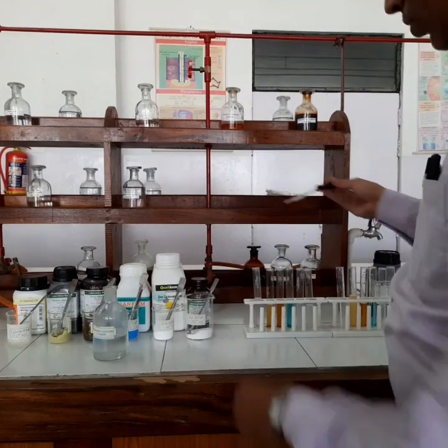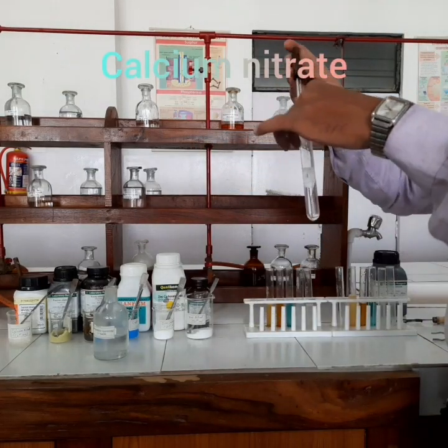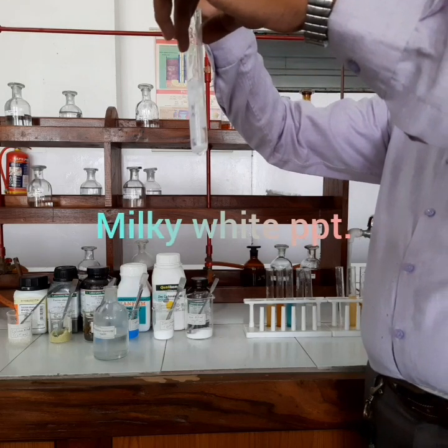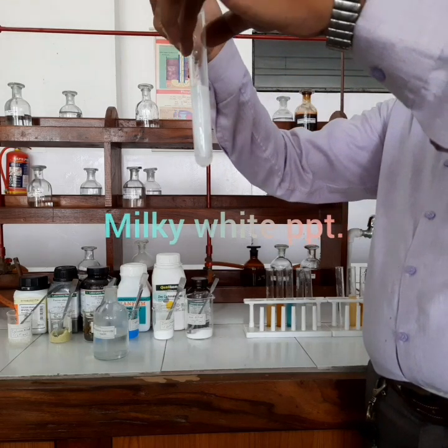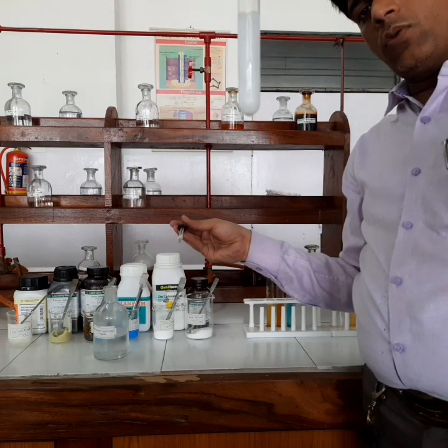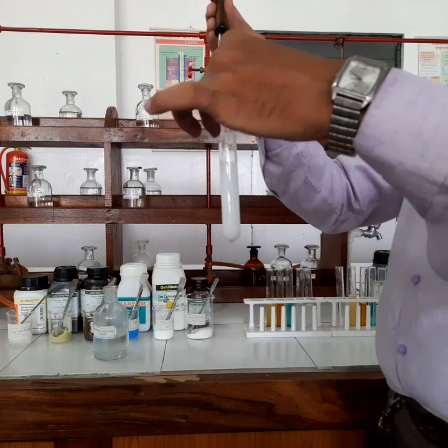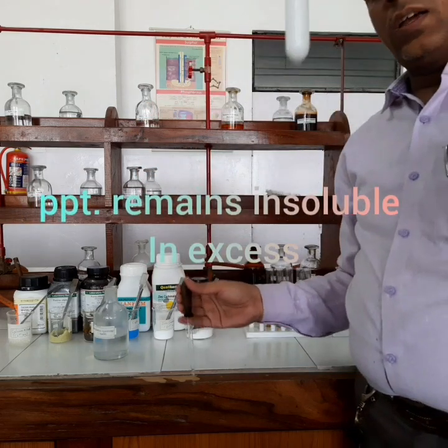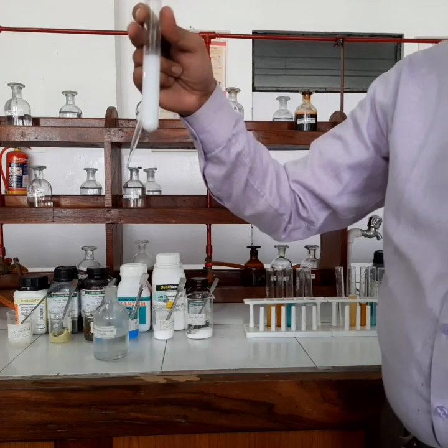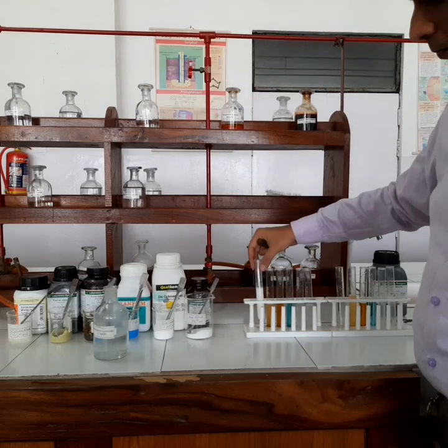So I have taken NaOH, and this is the aqueous solution of calcium salt. You can see, on adding it dropwise, a milky white precipitate is forming in the test tube. So this is what is going to happen when you add it in limited quantity. But when you add it in excess, what will happen? Again, on adding NaOH in excess, the precipitate of calcium hydroxide will remain insoluble. So this is for calcium with NaOH.